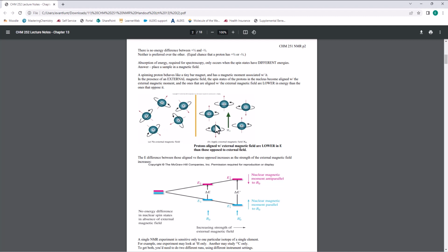So the principle behind NMR spectroscopy is that depending on what is near or around a particular atom, whether it be a hydrogen or a carbon or anything else that's NMR active, the time it takes to relax back to its natural state will change.